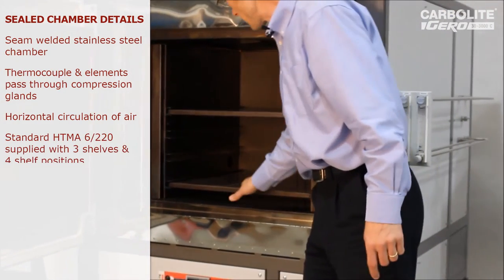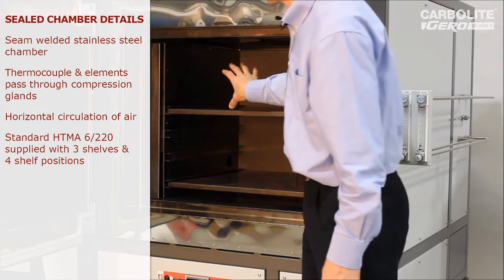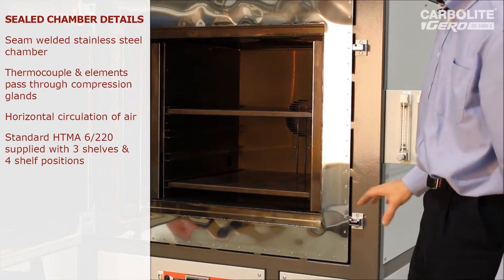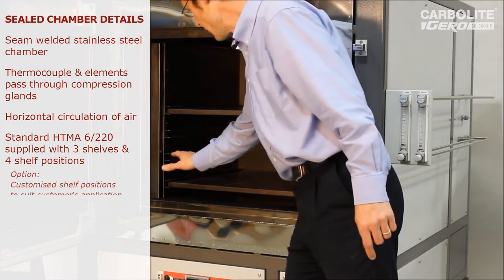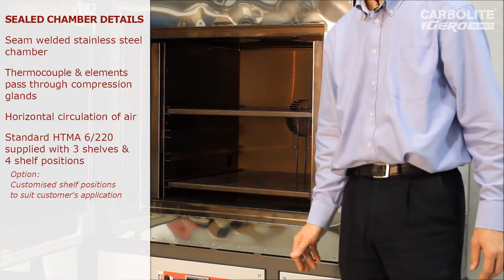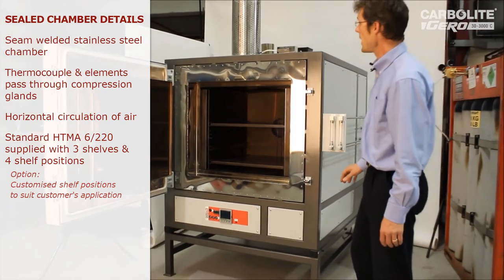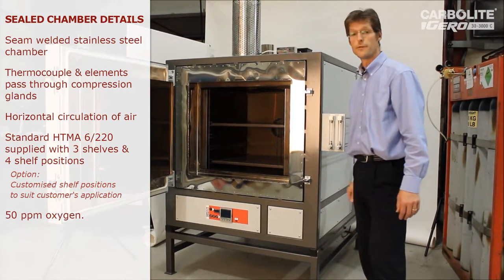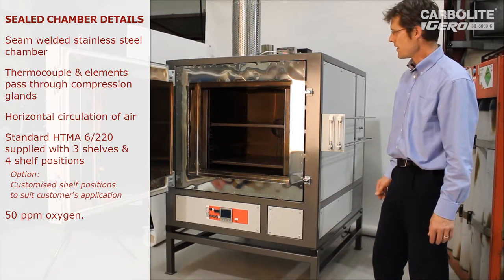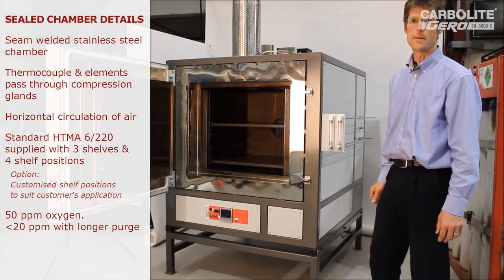This oven is fitted with two shelves. In this case it's going to be used for heat treating semiconductor wafers, so the customer will put a rack of wafers on each shelf, though those can be configured in many different ways with more shelf runners and positions as required. This style of oven can easily achieve 50 parts per million of oxygen when purged with nitrogen or argon, and if left to run longer can get down to approaching 10 parts per million of oxygen.